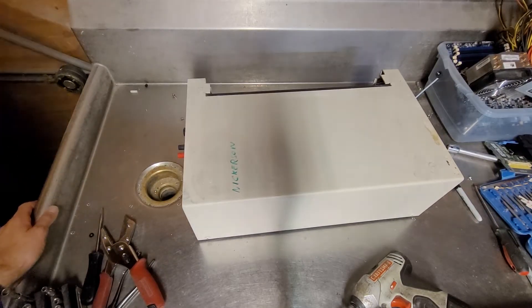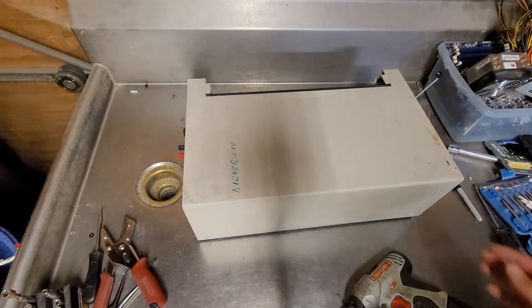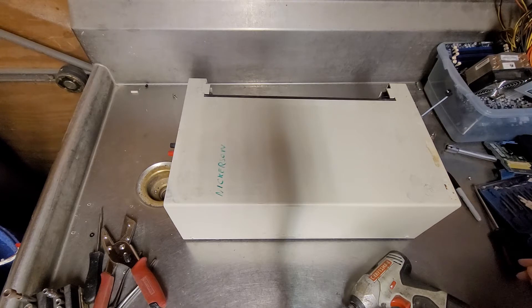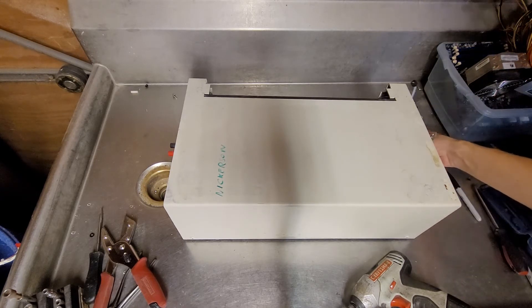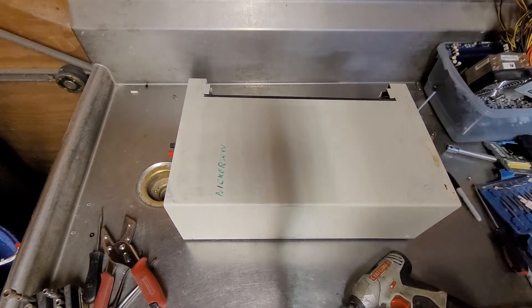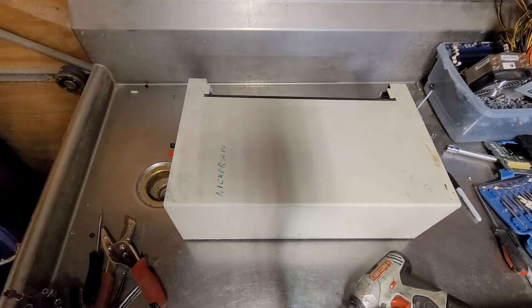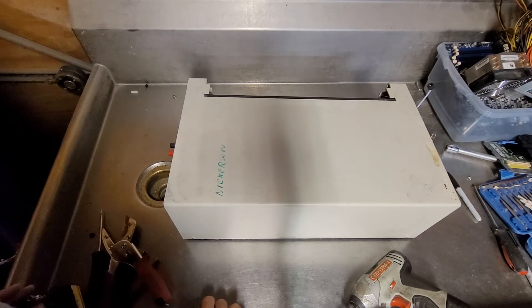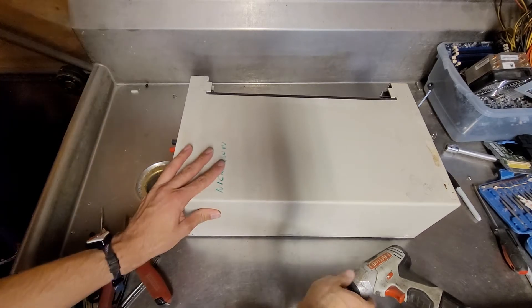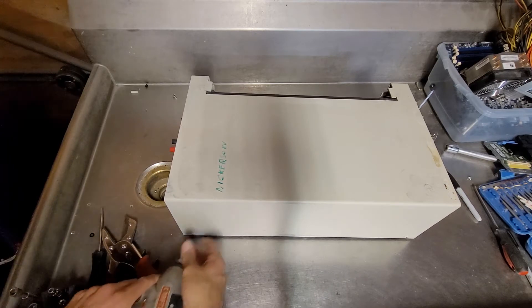Got another teardown on my workbench in the warehouse, and this is an ISCO model 2350. I don't know what it does. I think it's related to the other piece of ISCO equipment I tore apart, because they were tied together. I believe it's like a pump assembly of some sort, but I'm just going to start tearing it down.